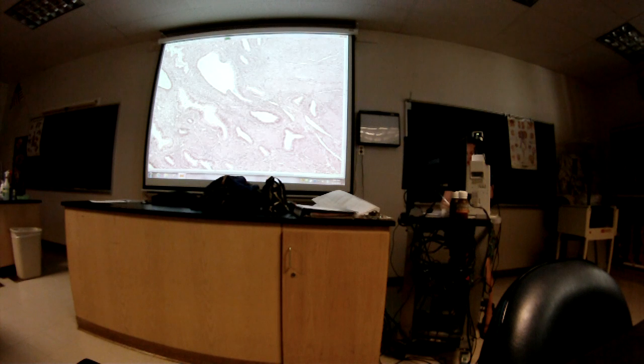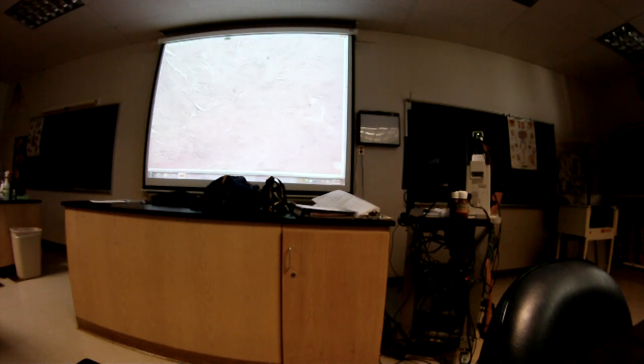What's the name of the main layer? All right, question 3. Name the structure. Question 4. What kind of tissue is this?